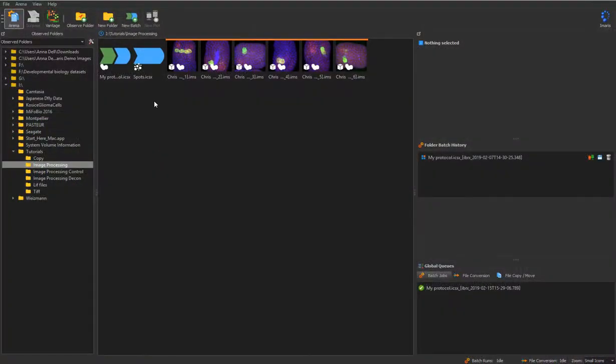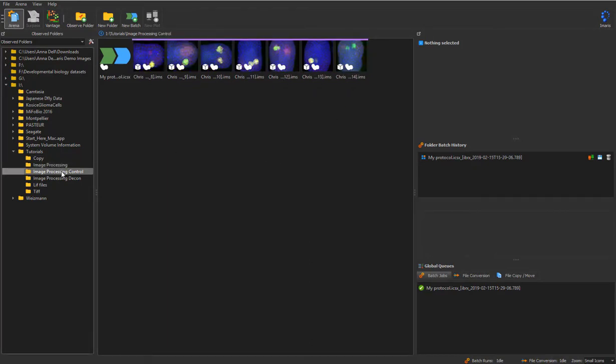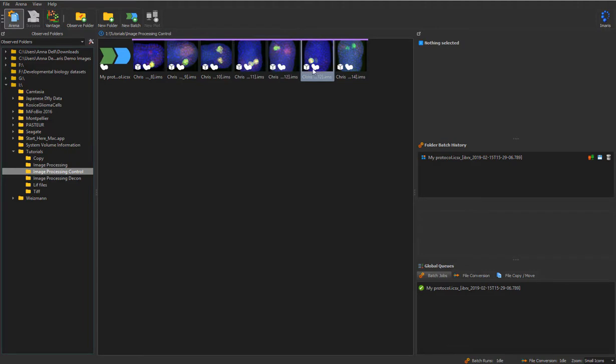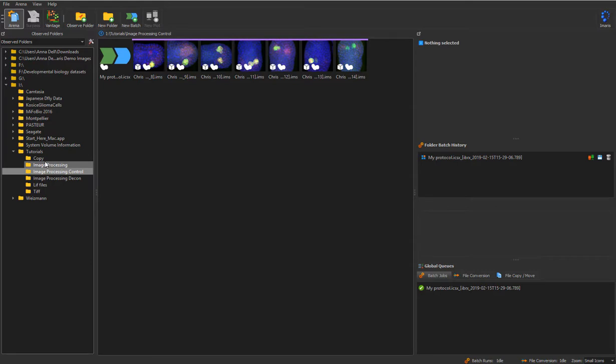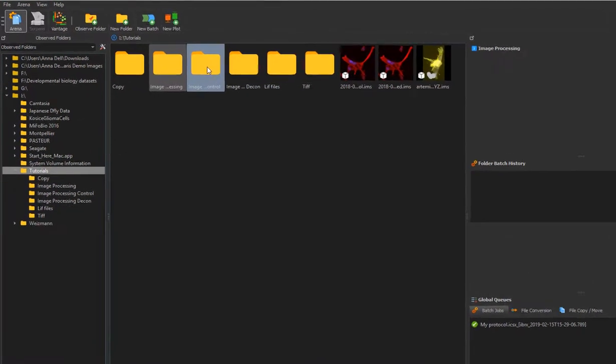The same Batch protocol can be run to analyze another folder. I have previously run the same Batch protocol on all images within the folder Image Processing Console. To compare the results within one plot, simply go to a parent folder, then select child folders you want to compare and click a new plot icon.